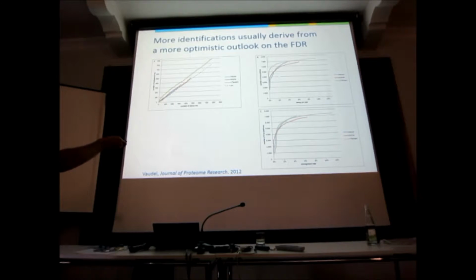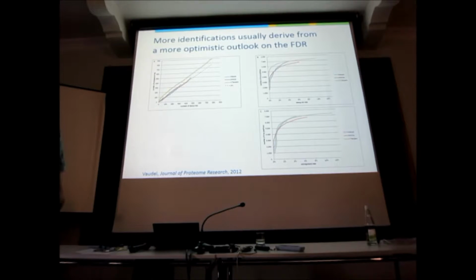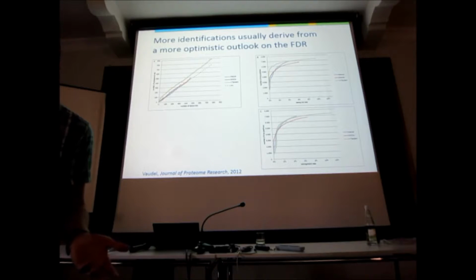So Tandem gives you more. These two give you about the same thing. So why is Tandem superior? The thing is, it's not. When we look at the entrapment rate, now decoys are gone, and we just look at Pyrococcus. But since they are a type of decoy, we can do an FDR calculation based on Pyrococcus.